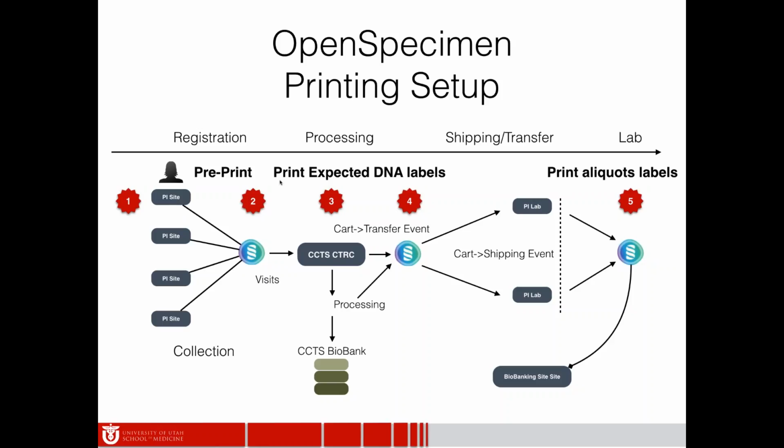After that, there will be some other protocols that do have a higher volume. This is research, so it's not the clinical enterprise. We don't have thousands of samples coming in the door every day, but per protocol, it's anywhere between 5 to 50 samples a week.